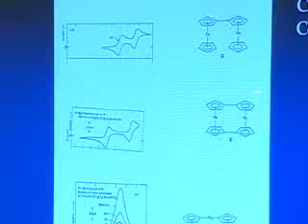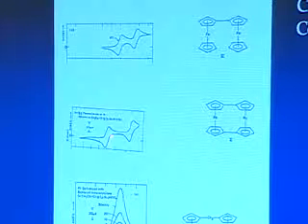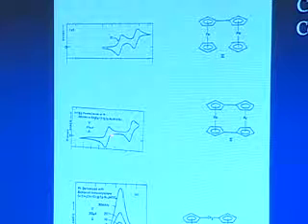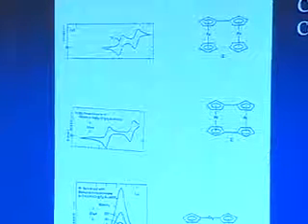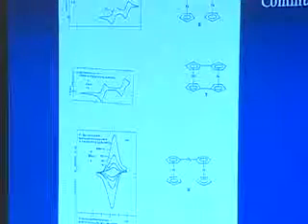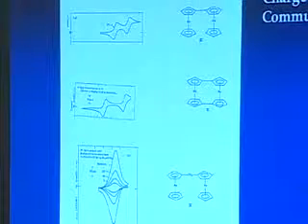So you make this structure and now do the cyclic voltammogram, on platinum, in acetonitrile with TBAP. And again, two reversible waves, and we did do the scan rate dependence, et cetera, which I'm not showing you, but they are reversible. You'll notice that the peaks are even more spread out. There's a bigger separation. So we have even stronger communication when we say those two ferrocenes have to be facing each other. Now the next question you can ask is, what if we start inserting some molecules in between here and pull those ferrocenes apart?